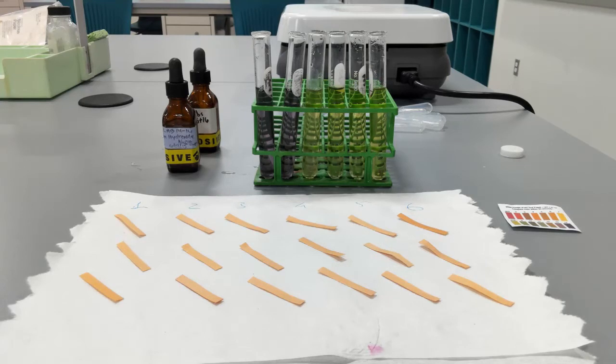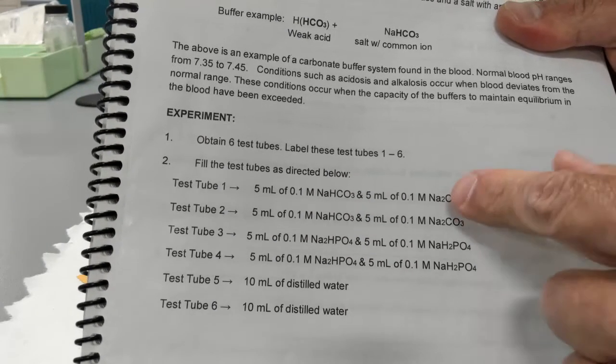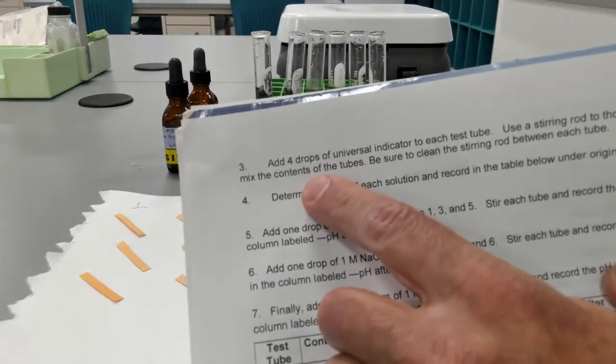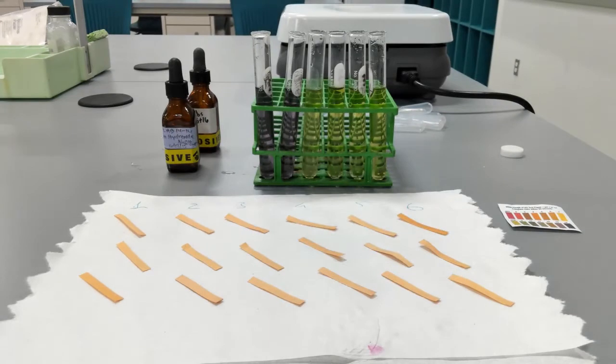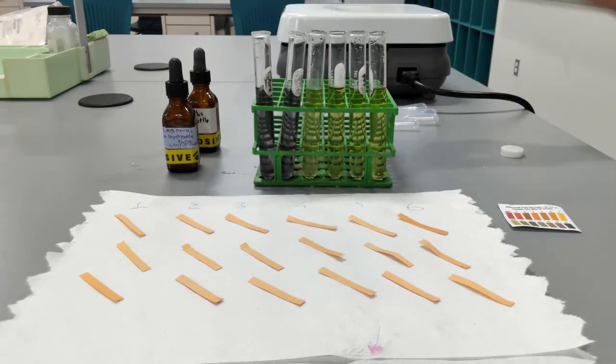So just as it is guided in the lab, I've got 6 tubes. The first 2 tubes contain carbonate buffer, 3 and 4 contain phosphate buffer, 5 and 6 contain water. Each tube received 4 drops of universal indicator, and now we're going to determine the pH of each solution.